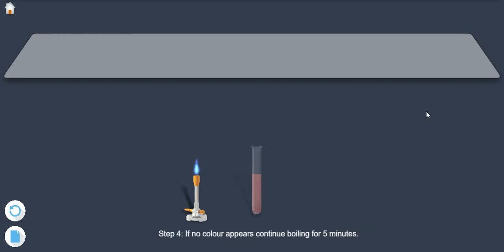Step 4: If no colour appears, continue boiling for 5 minutes.